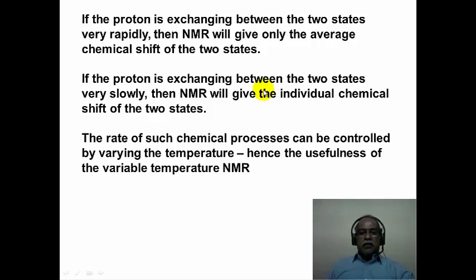The uncertainty will set in terms of the determination of the chemical environment of the particular proton. As a result of that, in between states where the rate process is neither too high nor too low, there will be a large uncertainty. Broadening of the signal is what one typically sees in the variable temperature NMR spectra.